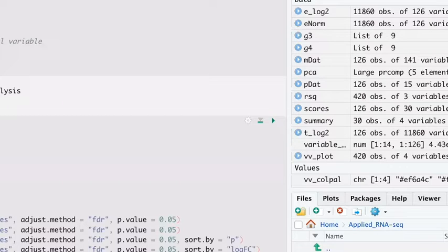because if you're doing this sort of analysis, it is very important to have a look at what is going around and how methods are constantly updating and the discussion surrounding them. Because when people ask you why you use this method, you need to have an answer that is backed up by your literature search as well as your actual computation. And so I will be adding that paper. But for this workshop, we're just going to keep on working through them. That doesn't mean anything else is wrong. It just means one might perform better than the other.